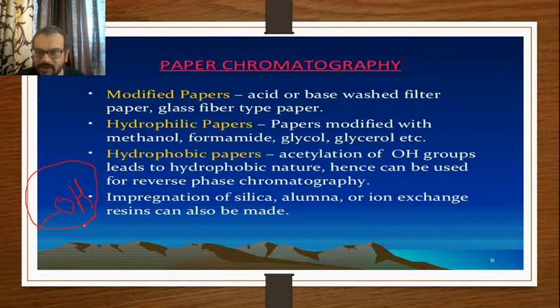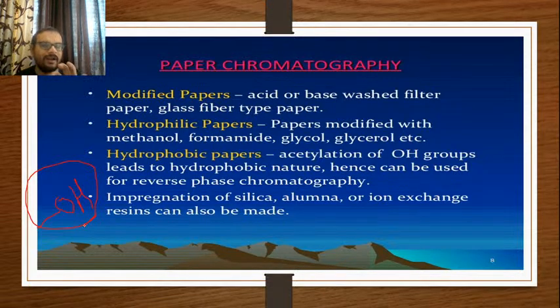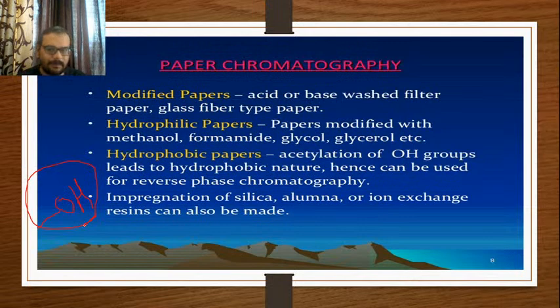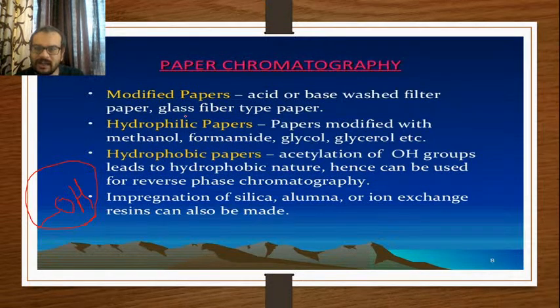So what I mean to say is, there are certain modified and treated papers, more specifically not filter papers, which are used for the separation of different compounds that are not easily separated using Whatman filter paper. They are called modified papers just because you wash the filter paper with an acidic or basic solution to make it compatible for the separation of your choice of compound. Okay, it may be treated with the glass fiber type paper. Okay, this is the modified paper.